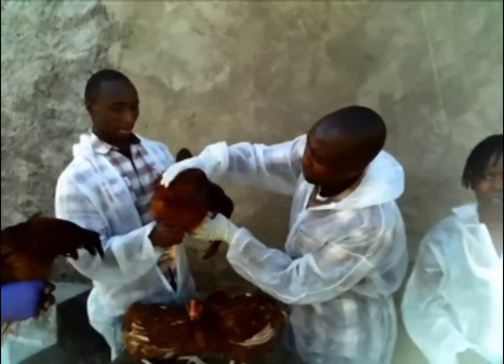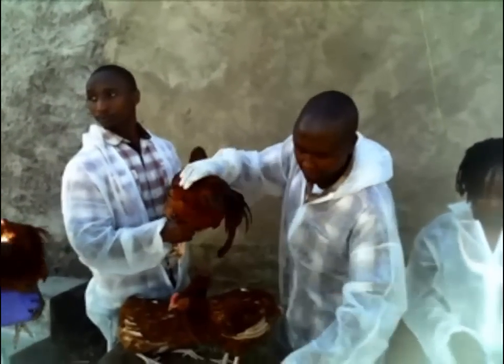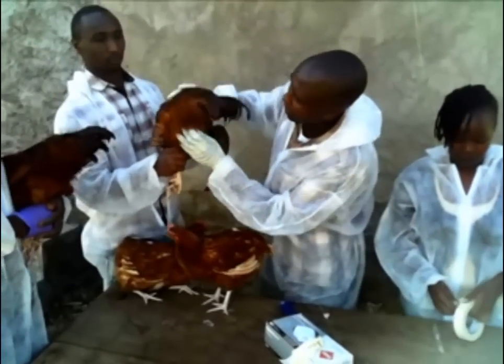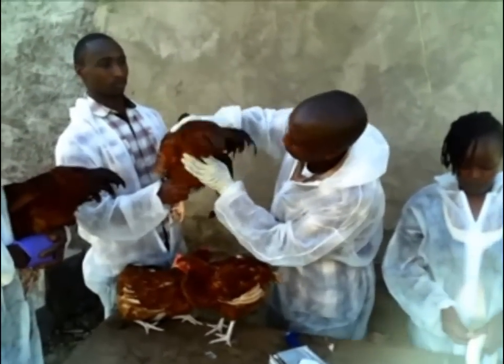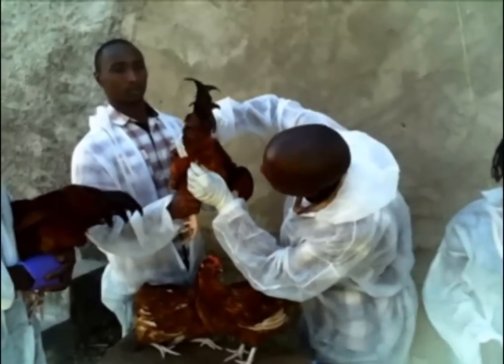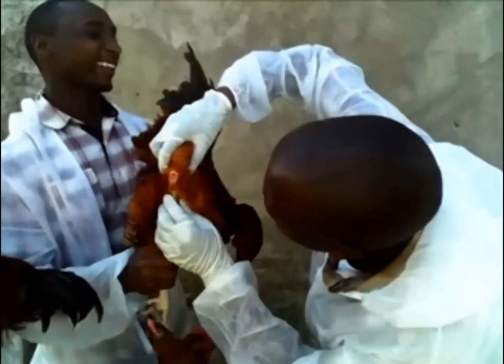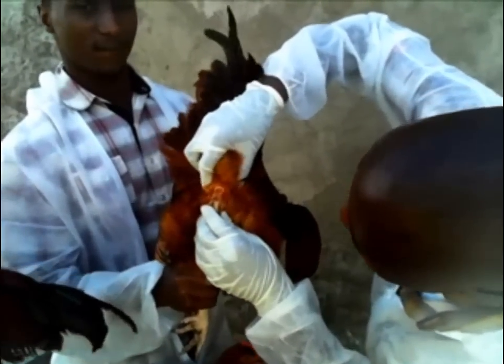So, once the cocks is stimulated, you just pick your test tube while still continuing stimulating, and then you start pressing the area — just now pressing the vent to make sure that you get your semen.